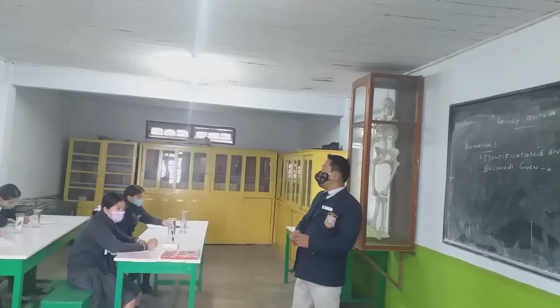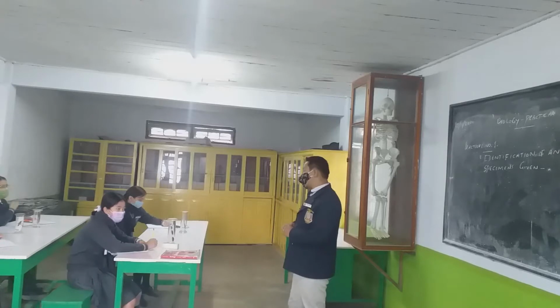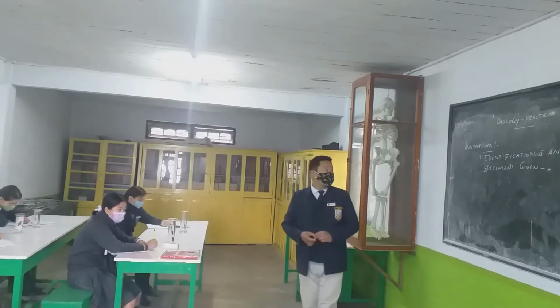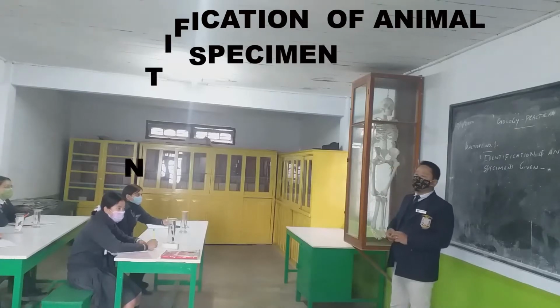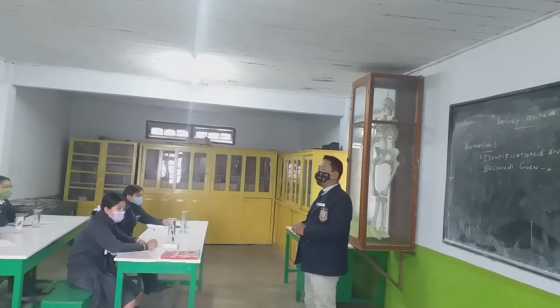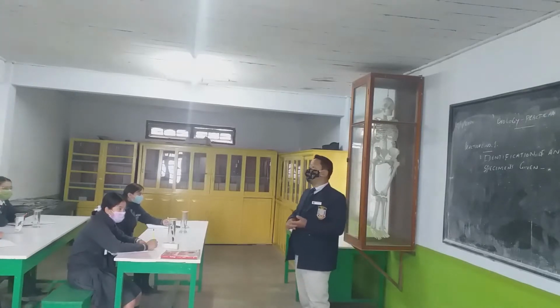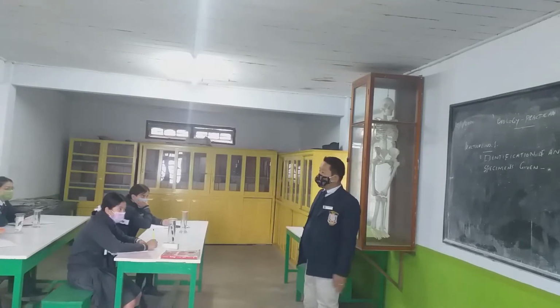So, dear children, we'll have a practical class today. Here we see mainly identification of animal specimens. There are so many specimens there. Some of them are vertebrates and some are invertebrates, stored in the place where they are all kept.